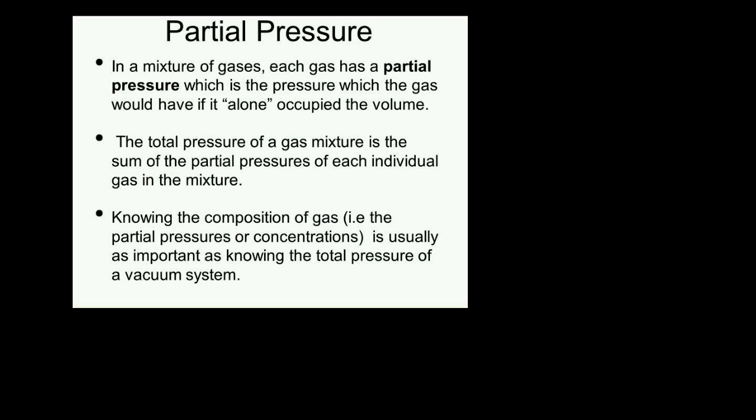The reason why we are all here learning about residual gas analysis is that we all know that the composition of a gas, that is the partial pressures or concentrations of gases in a vacuum chamber, is usually as important to know as the total pressure of a vacuum system.